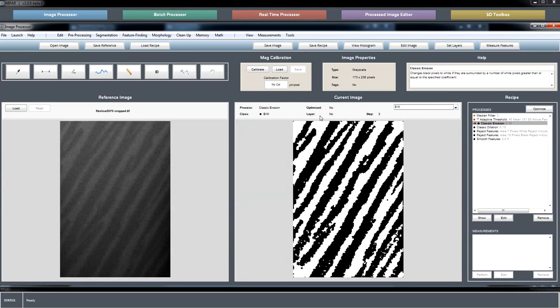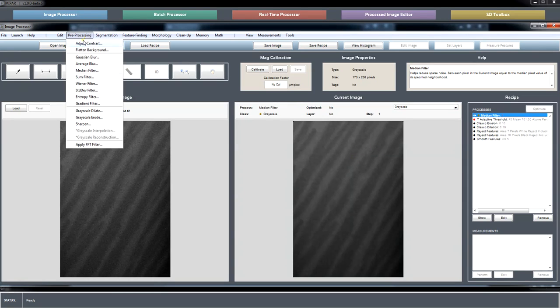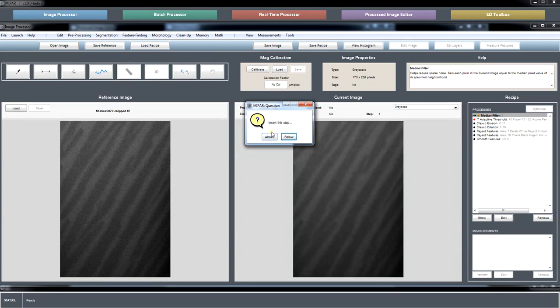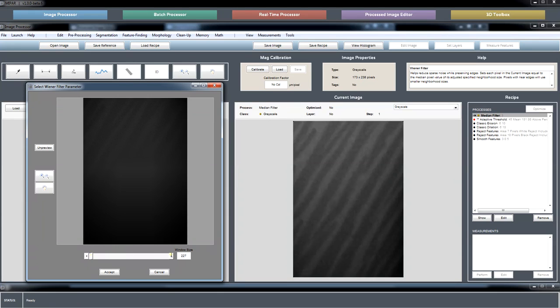So usually with noisy data, you end up maybe filtering it ahead of time with some kind of either a median filter, or a Wiener filter can be a decent approach. This is somewhat like a median filter, except edges are better preserved. And see, there's an example of where the sliders make no sense.